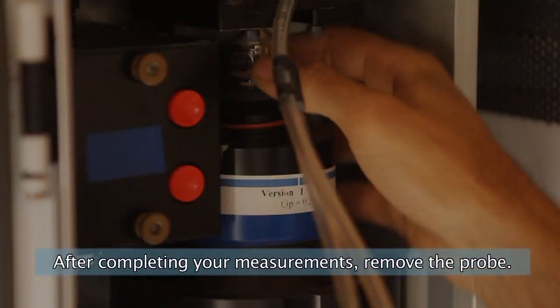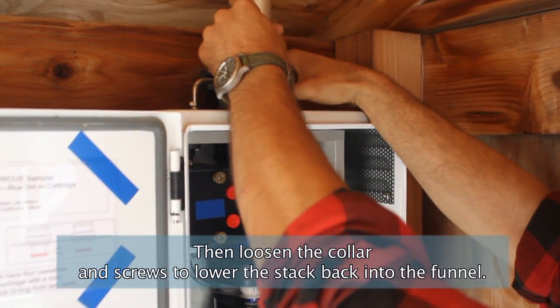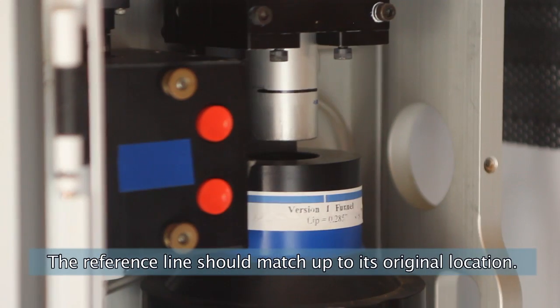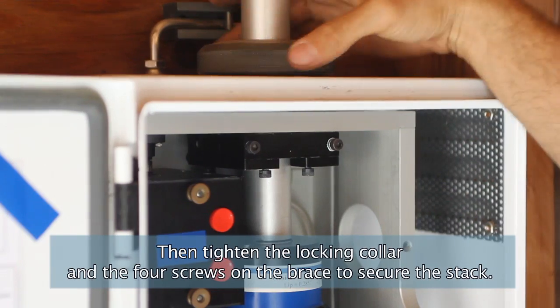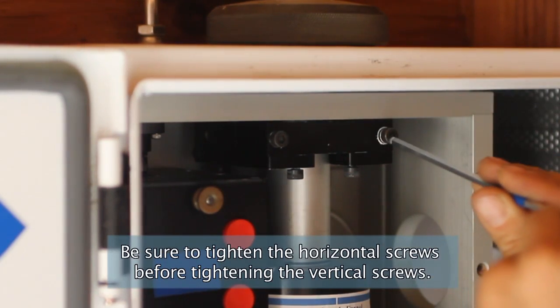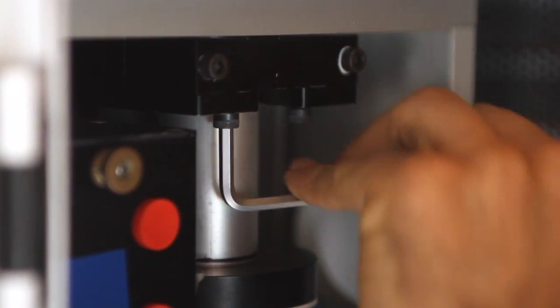After completing your measurements, remove the probe. Then loosen the collar and screws to lower the stack back into the funnel. The reference line should match up to its original location. Then tighten the locking collar and the 4 screws on the brace to secure the stack. Be sure to tighten the horizontal screws before tightening the vertical screws.